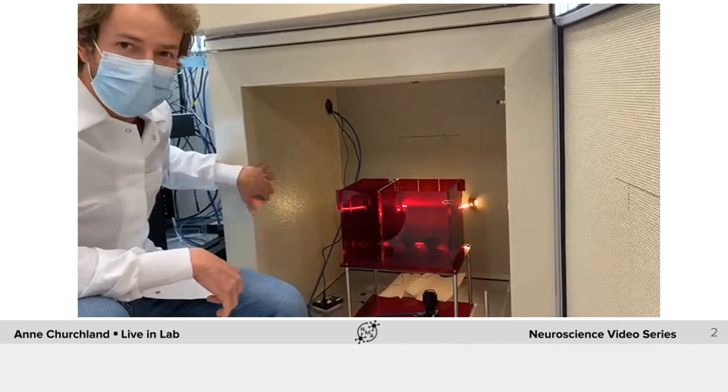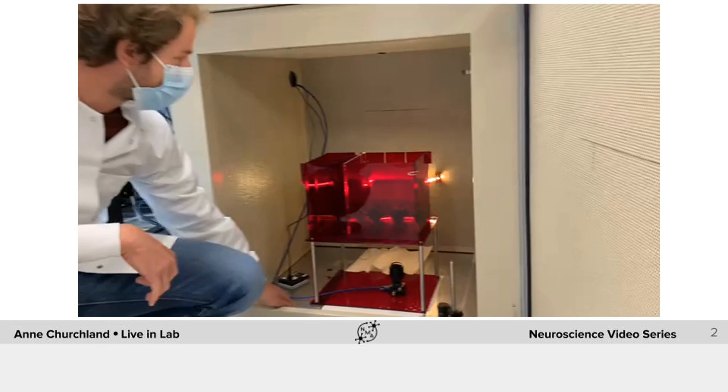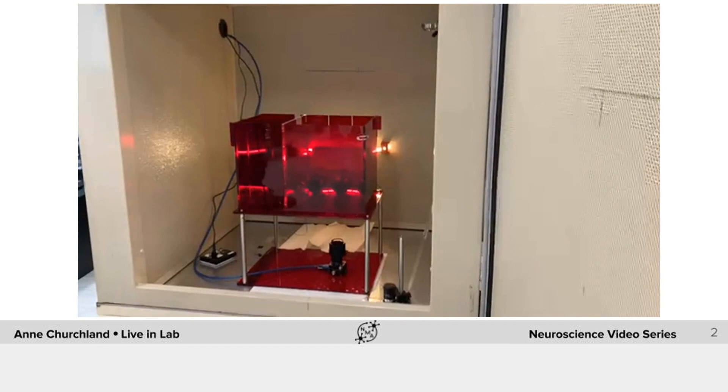So we're exposing the animals to our behavioral tests in a sound isolated booth with minimal lighting conditions and here we can also video track the animals from the bottom or the top if we want and we can present different stimuli.